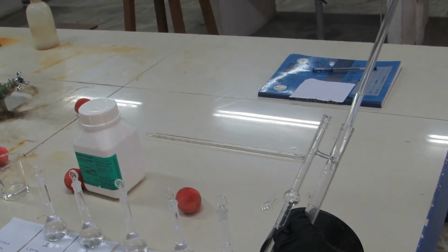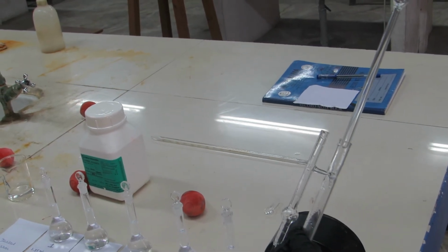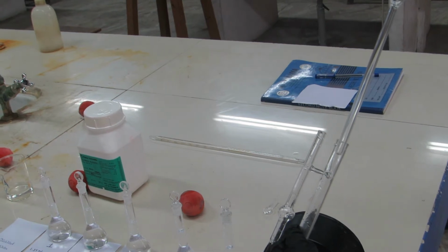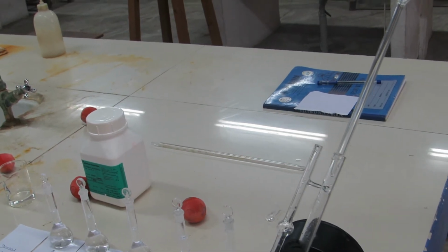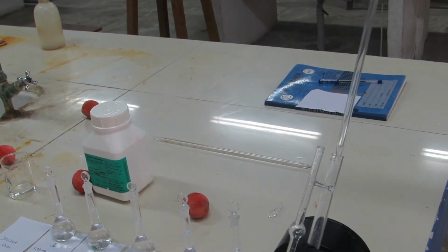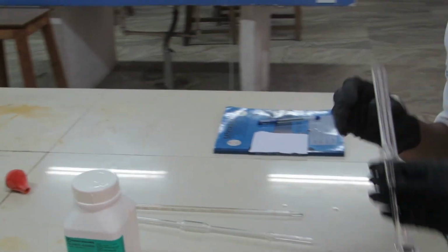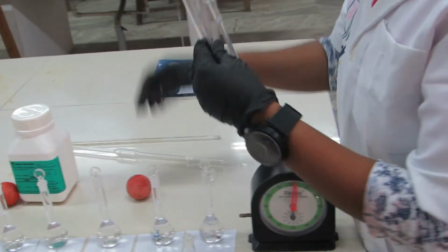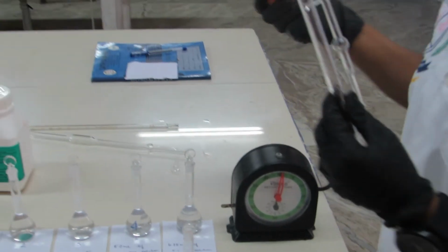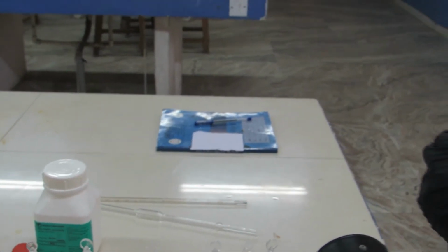Finally, we have to blow that water also into the viscometer. So once you take the water into the viscometer, by using our rubber bulb, we have to suck the water on the left side.